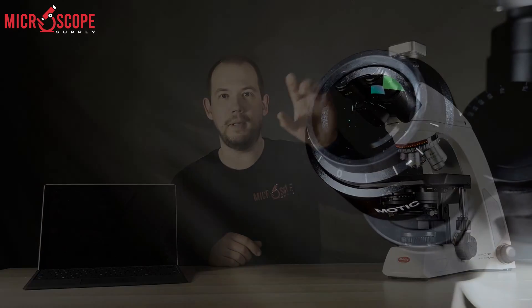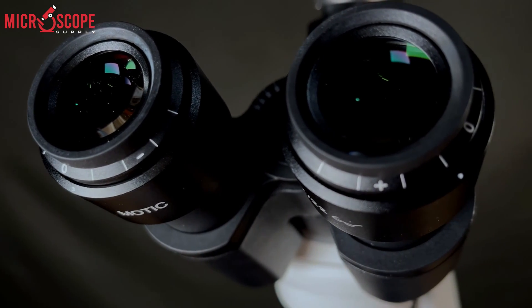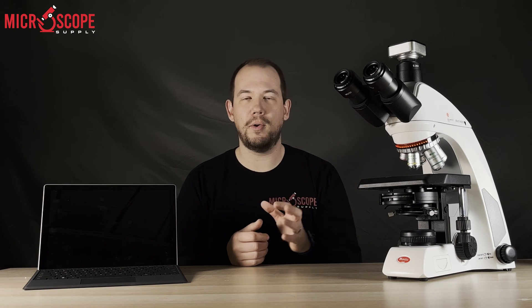The C2 comes standard with 22 millimeter field of view eyepieces. A lot of microscopes in this price range will go with a 20 millimeter, which is a slightly smaller field of view. 22 millimeter is what you would see on a really nice clinical quality microscope, so we are super happy that Motic has gone standard with that 22 millimeter field of view eyepiece.